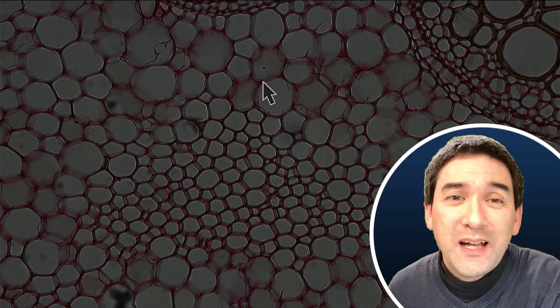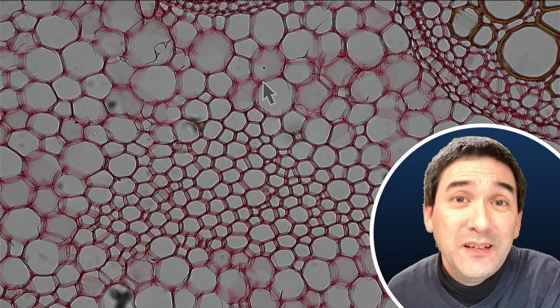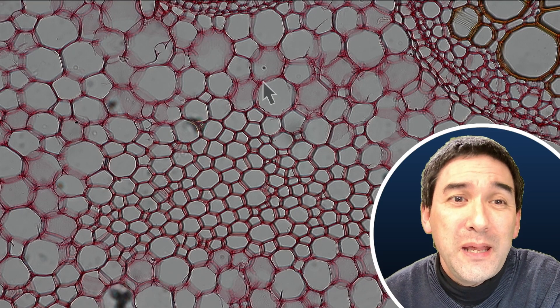And that's indeed the case, because the cross section is so thin that the contents of the cells were lost. That's actually deliberately done so that you're able to see the patterns of the cell walls much nicer. If you were to cut it a little bit thicker, then you would also be able to see the cells' contents. And while that also is interesting, it does not make the patterns of the individual cells as visible.